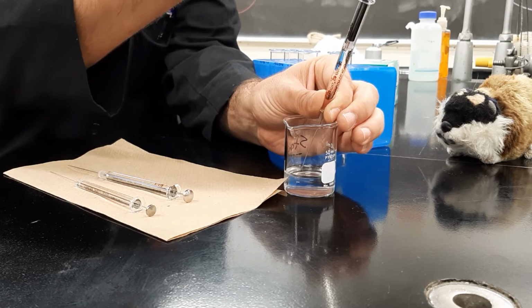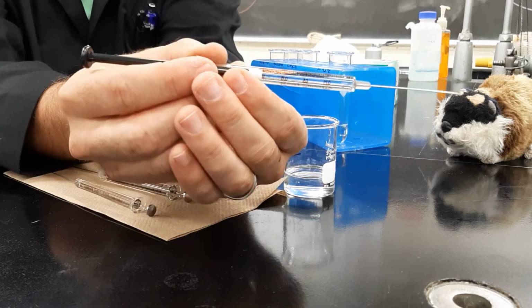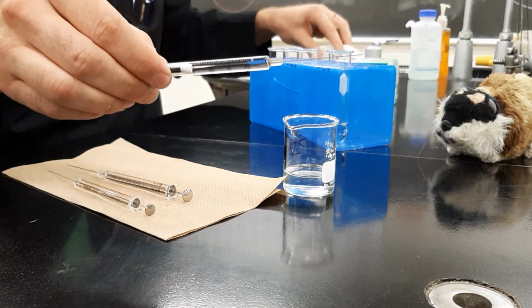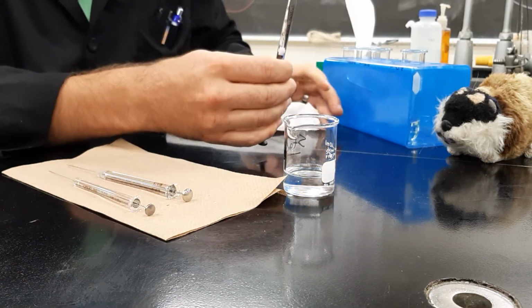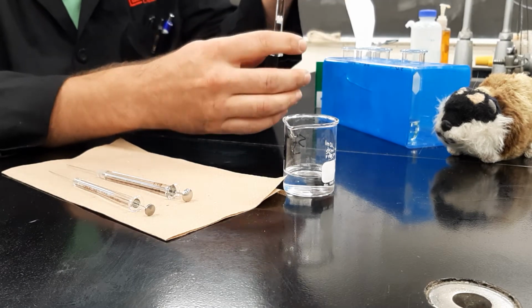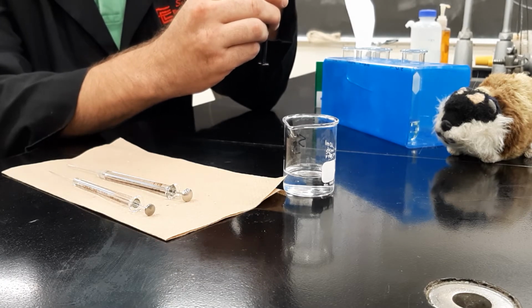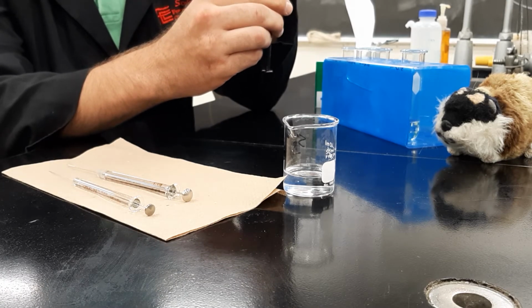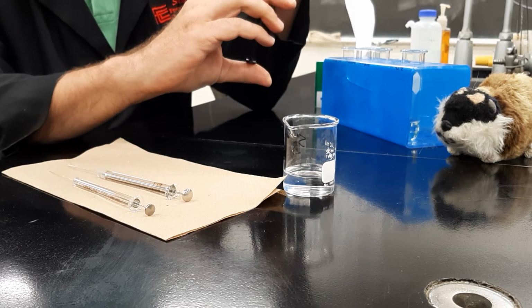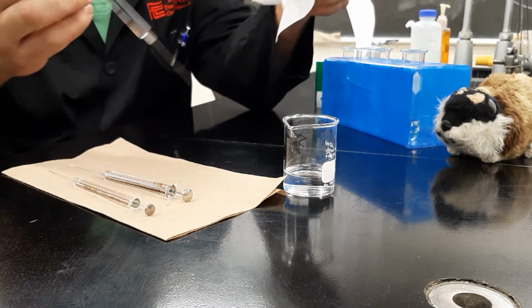to a final volume. Now, it's true in this case and in many cases that you get an air bubble in there. So you clear it just like a doctor does, and I recommend this method here. I recommend flipping it up vertically, taking a chem wipe and putting it around there, and then pushing the air bubble out. Sometimes, if the air bubble is very small, you want to draw a bigger air bubble to join the air bubbles and then push them out together. Then you'll bring the syringe down to the line and go ahead and dispense.